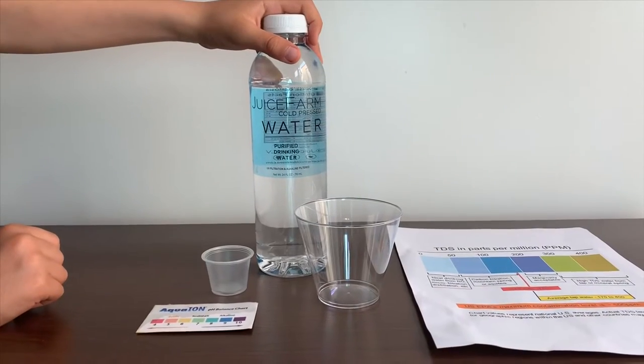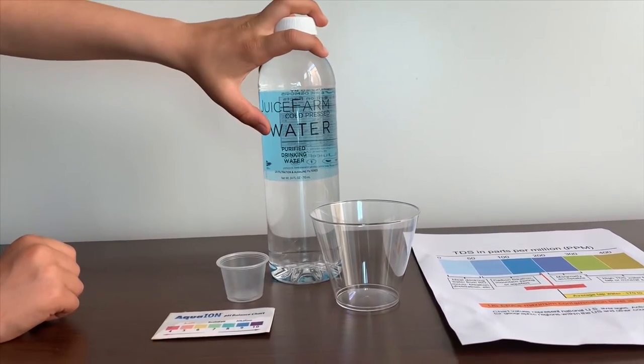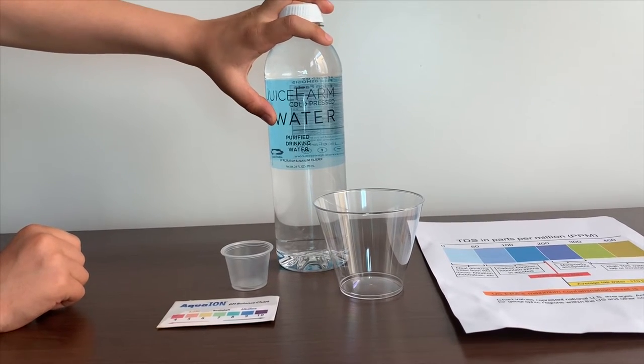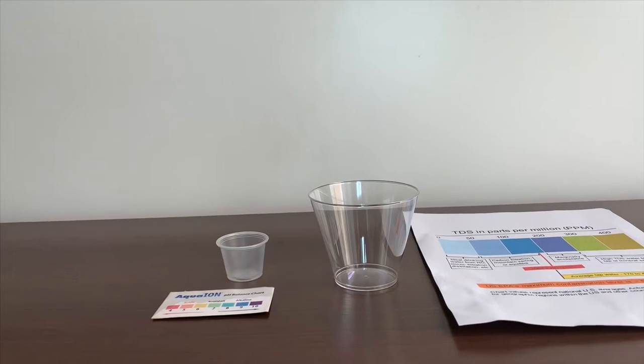This is JuiceFarm Cold Pressed Water. It is purified water and it is processed with reverse osmosis. Let's test the pH and TDS levels.